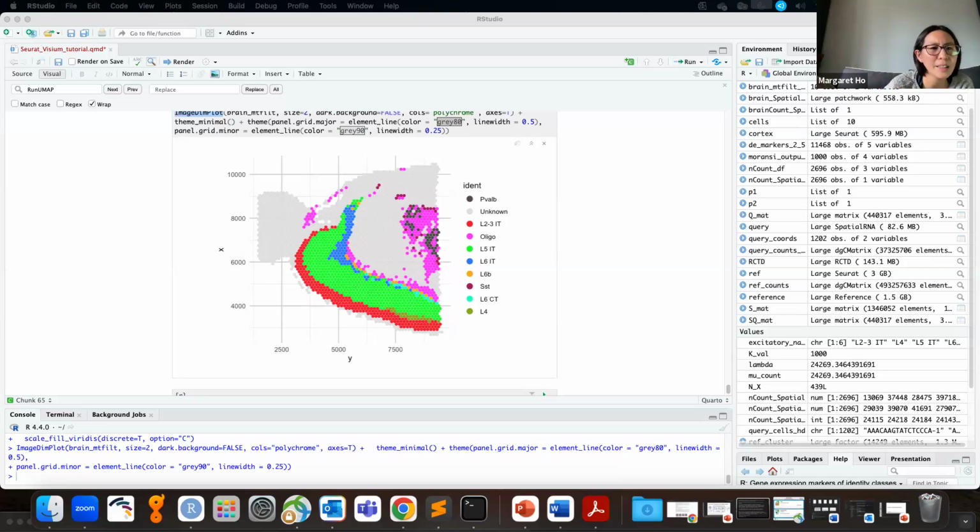I think I answered most of the questions. Feel free to email me or reach out to BCBB if you're interested. And if you have a specific request for a type of analysis, I try to keep everything fairly general, because with this analysis I wanted to give you an idea of how to pre-process the data, how to do very basic analysis like differential gene expression analysis, and how to do all this annotation. But I didn't want to get too far in the weeds because it's very specific to your project.